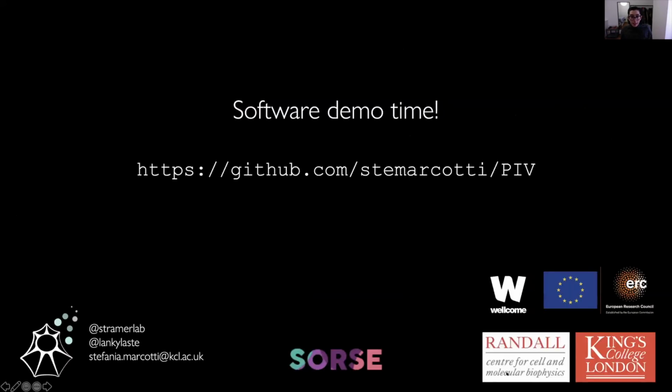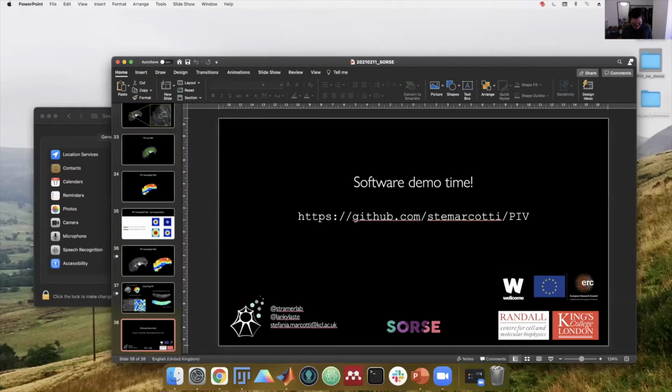Great. Now it's time for the software demo. You can find the software at this address on GitHub. Please do get in touch with us in case something doesn't work. That might happen. So here is my email down the bottom left corner, and our Twitter handle should you need to get in touch with us. But now I'm going to try my luck with the software demo.